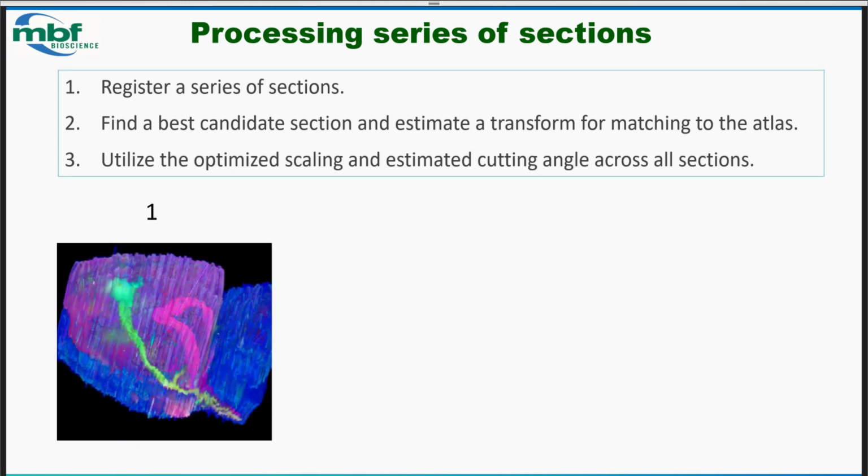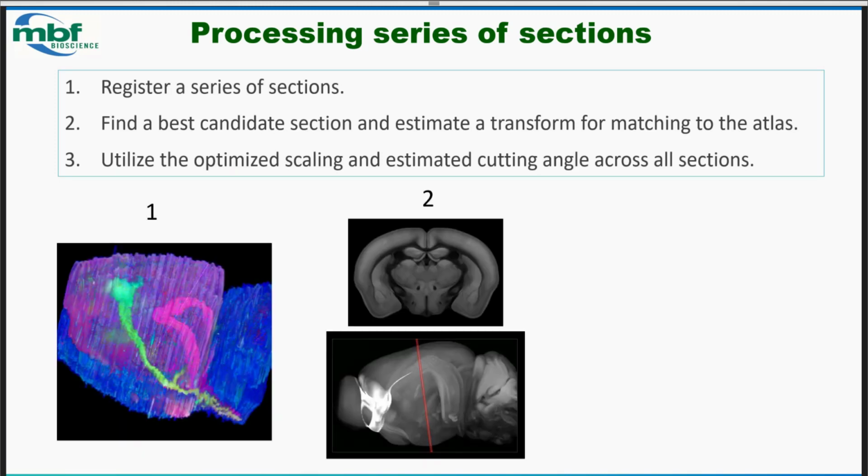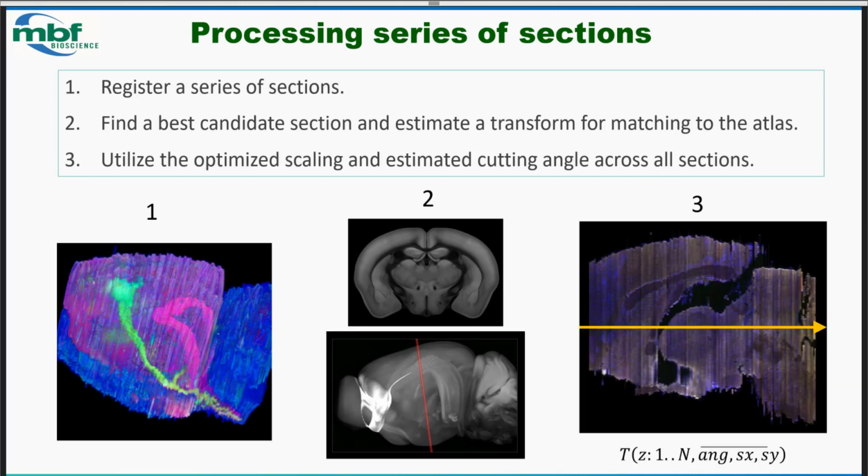To really drive home what the process is, we're going to start when we already have that aligned brain volume from serial sections and compiled. That's out of BrainMaker, which is inside of NeuroInfo. What we do is we take a representative section from that brain volume, that has a lot of landmarks that we can use to semi-automatically find a good fit equivalent section in the Allen average mouse brain, and that's part 2 here.